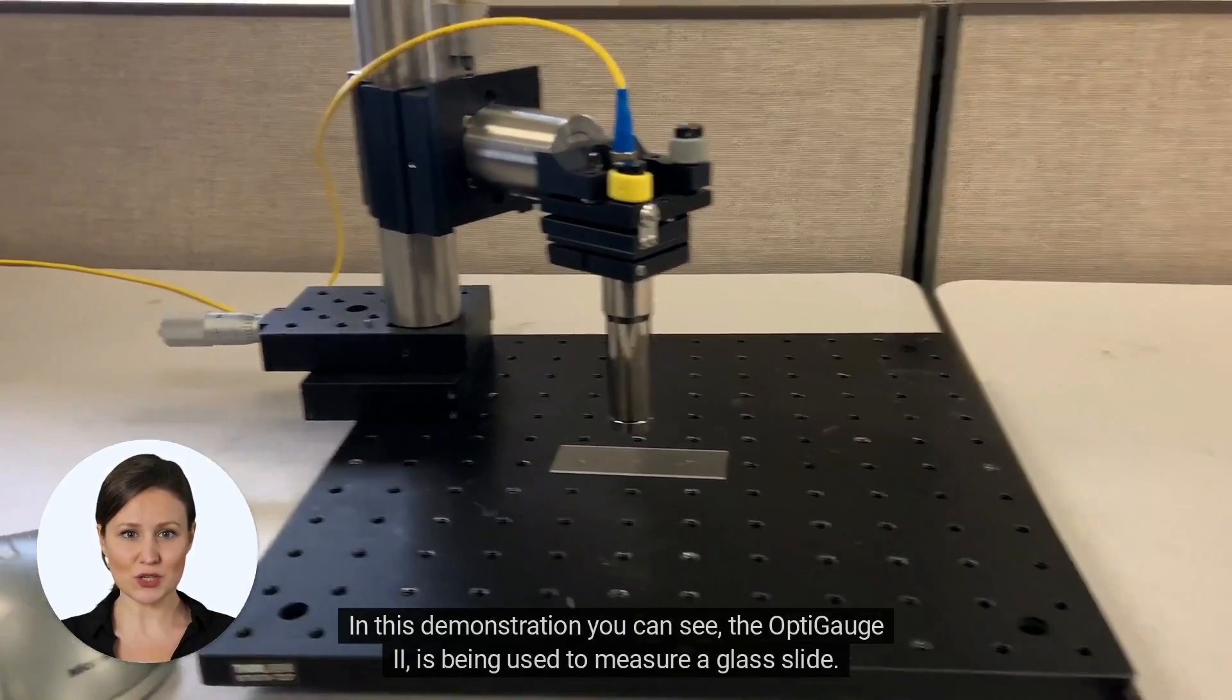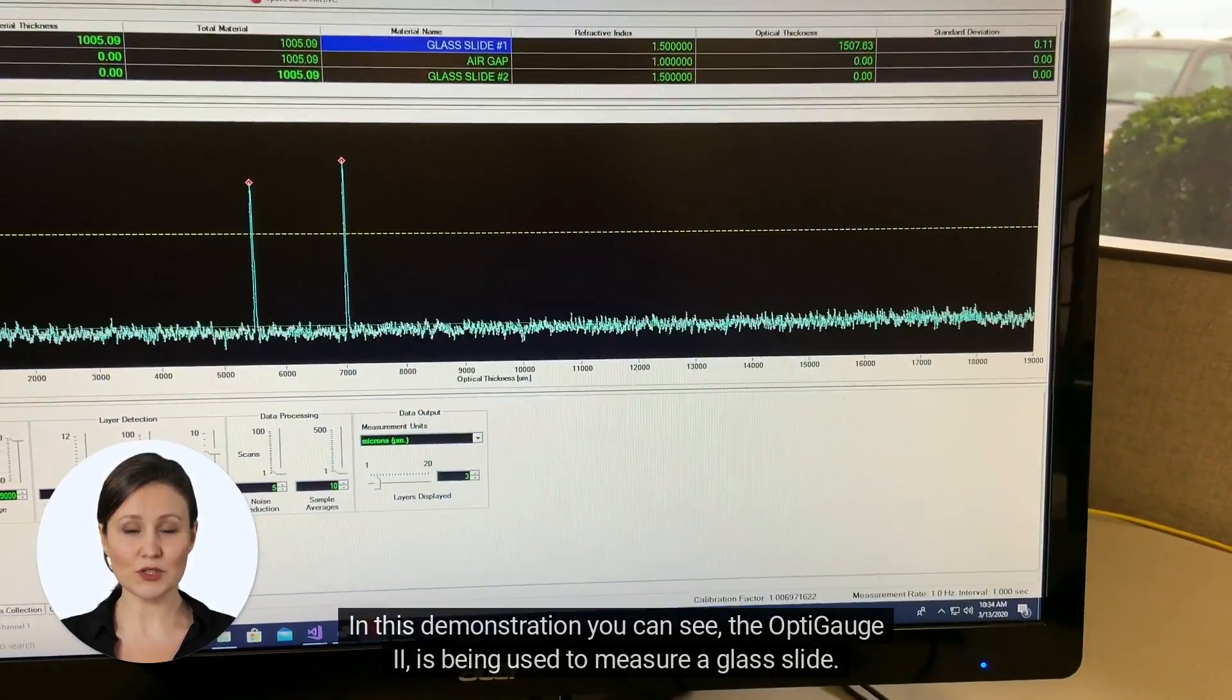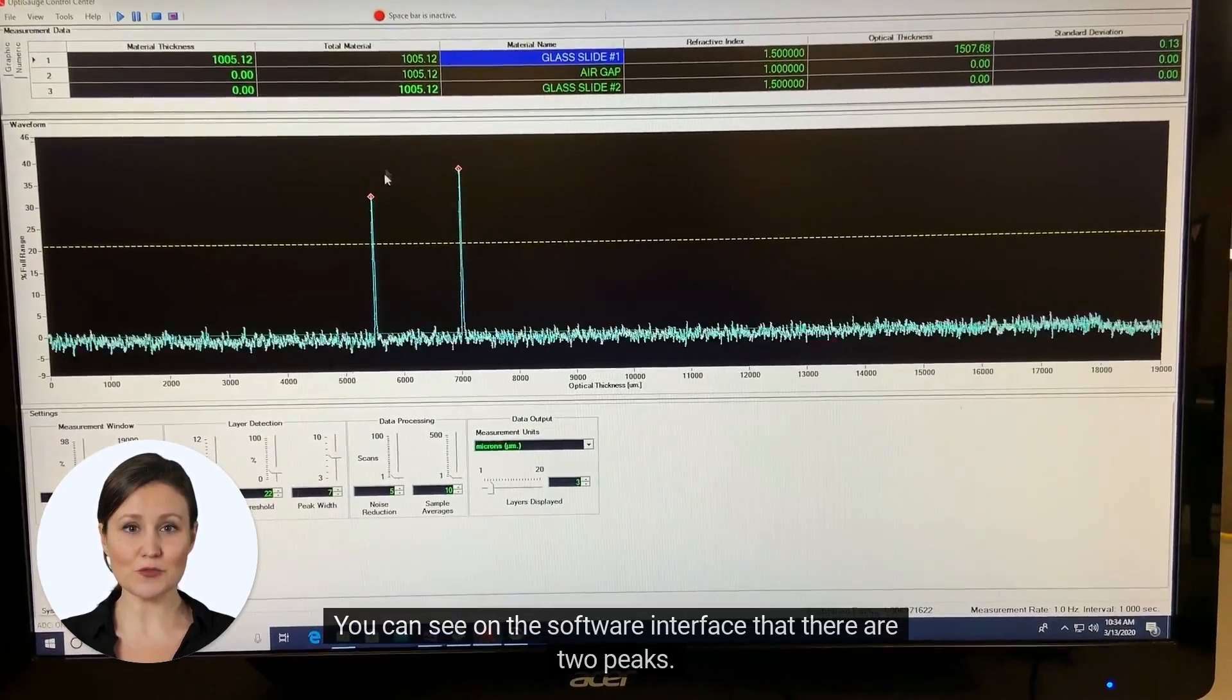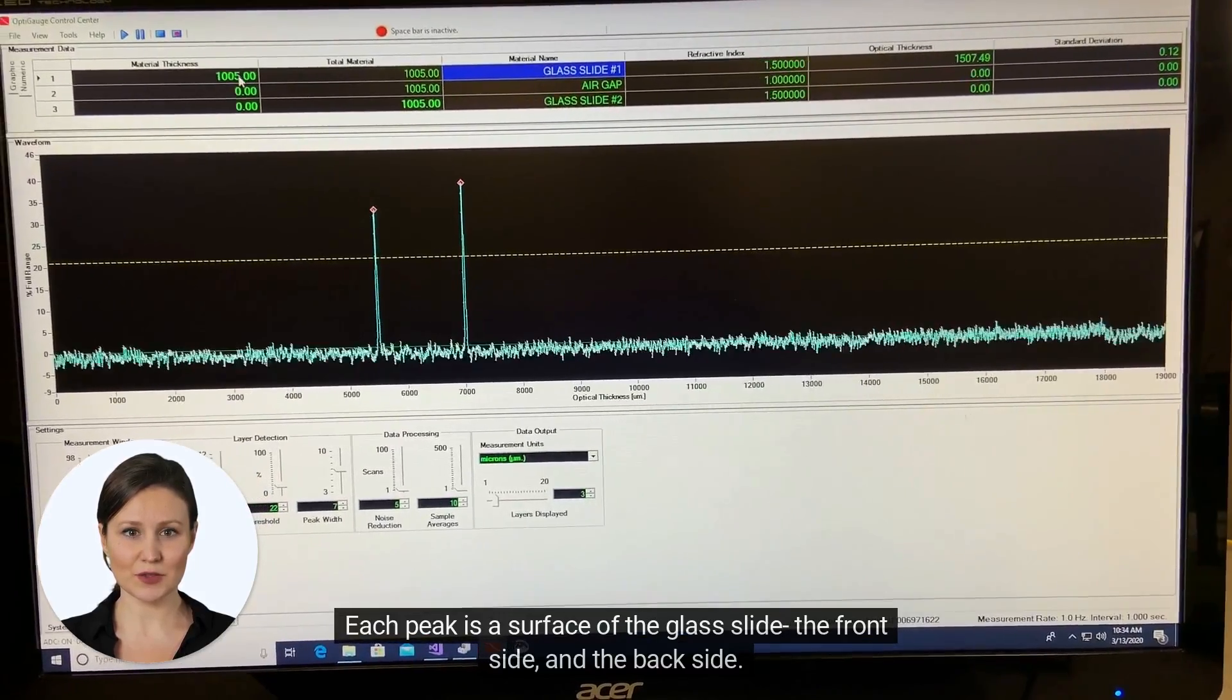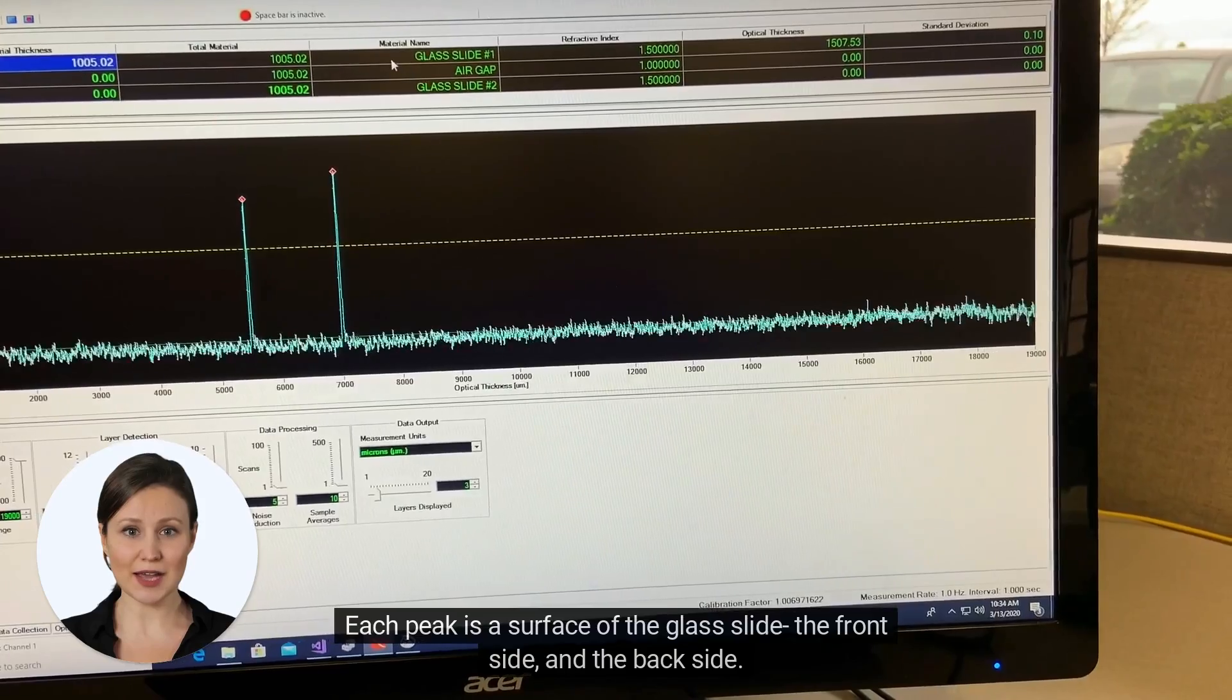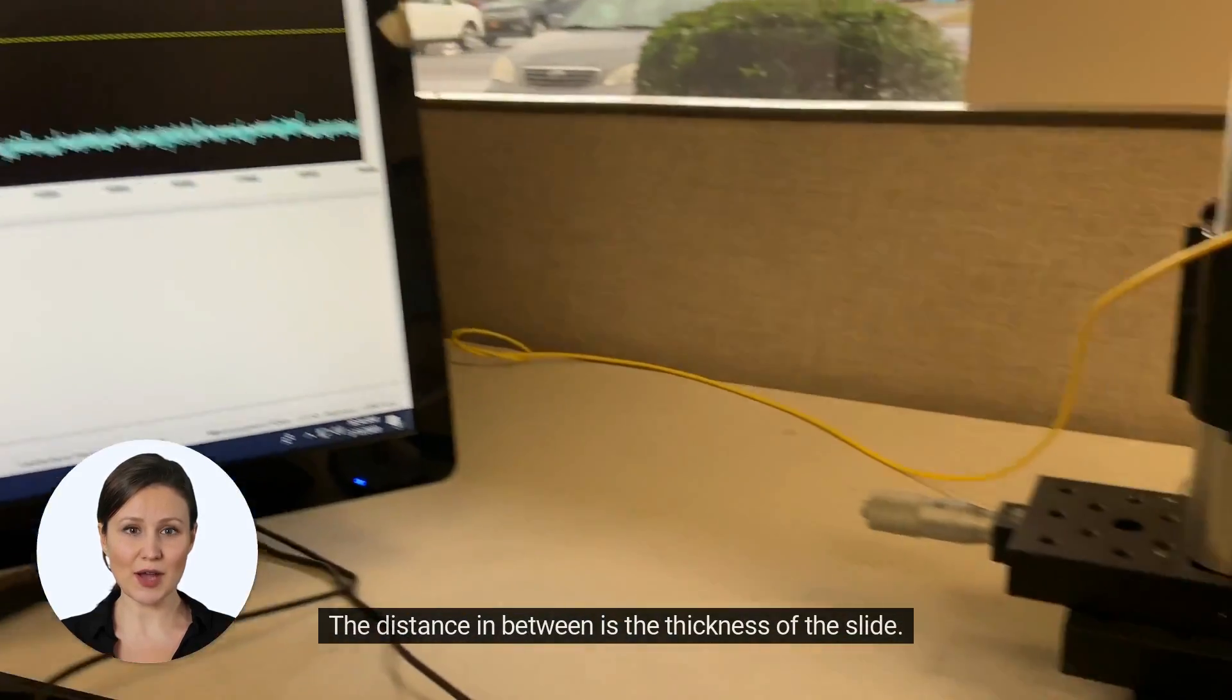In this demonstration, you can see the OptiGauge II is being used to measure a glass slide. You can see on the software interface that there are two peaks. Each peak is a surface of the glass slide - the front side and the back side. The distance in between is the thickness of the slide.